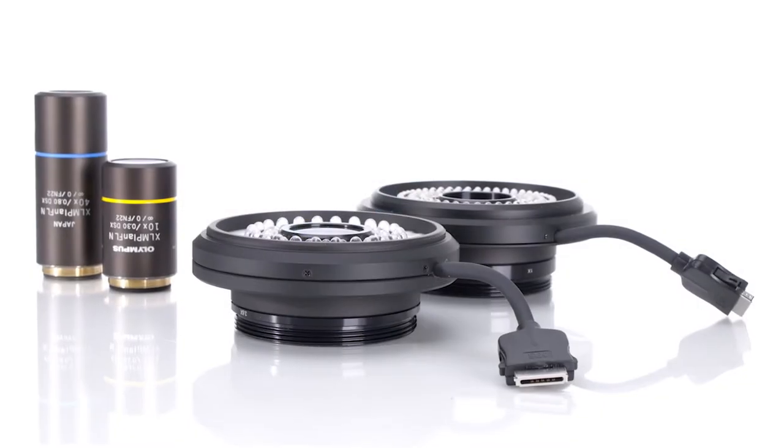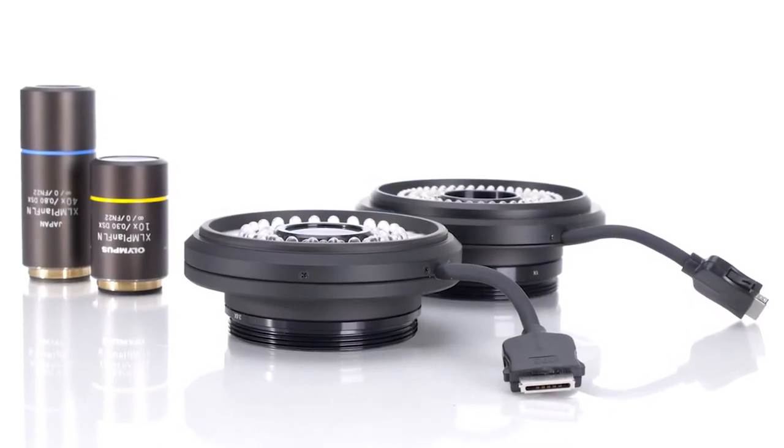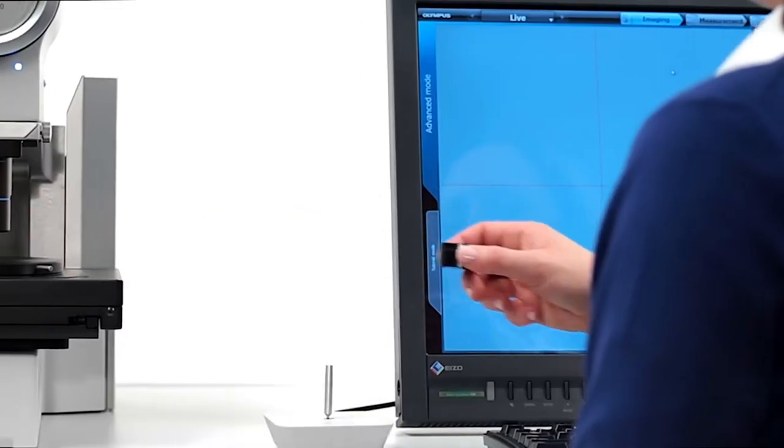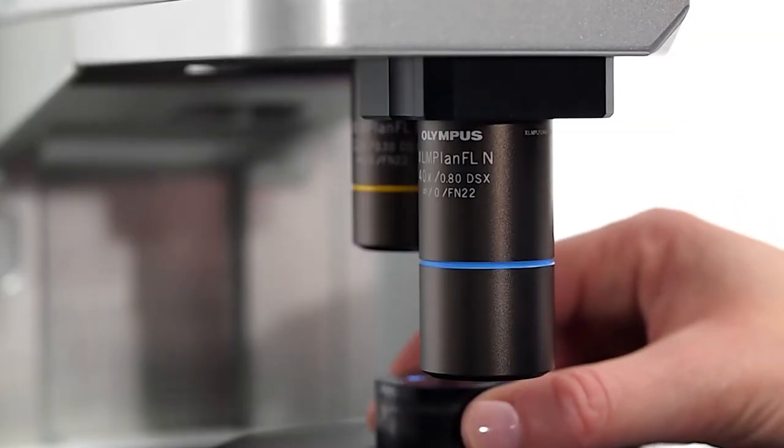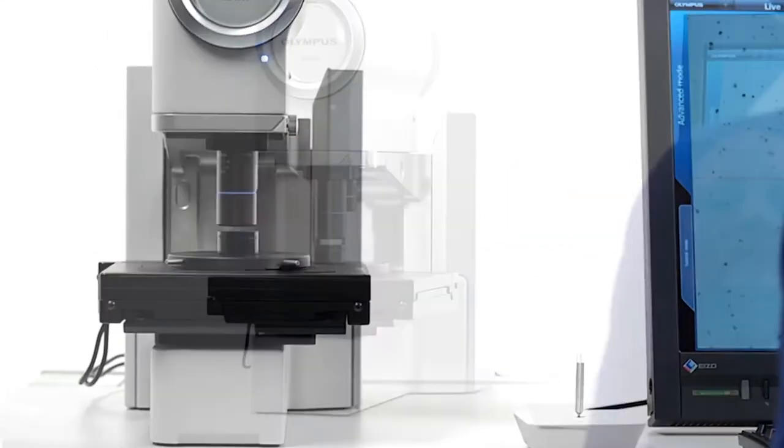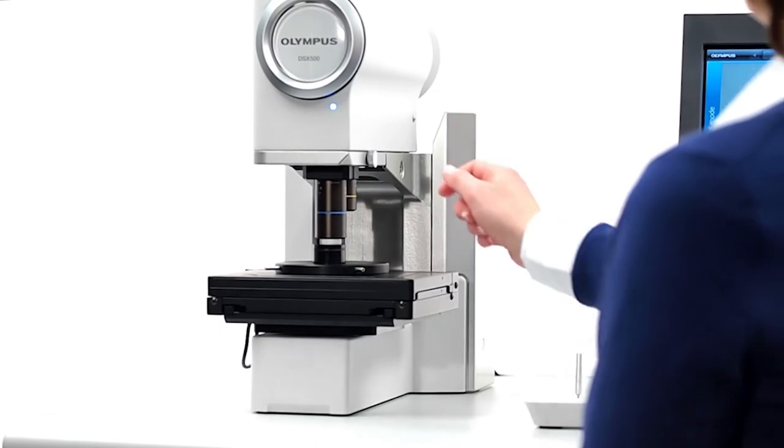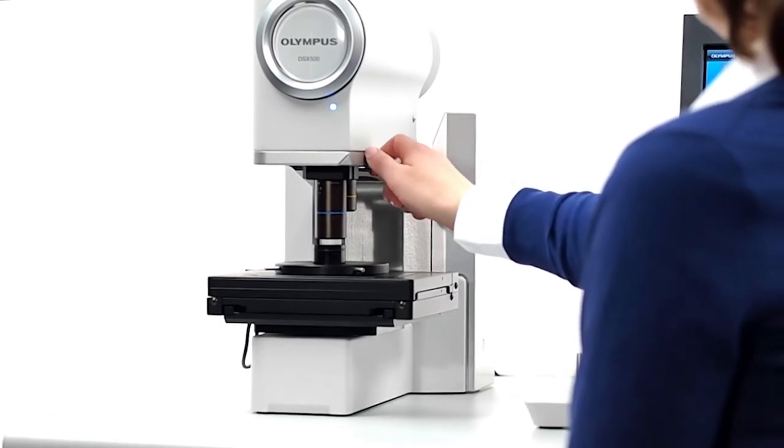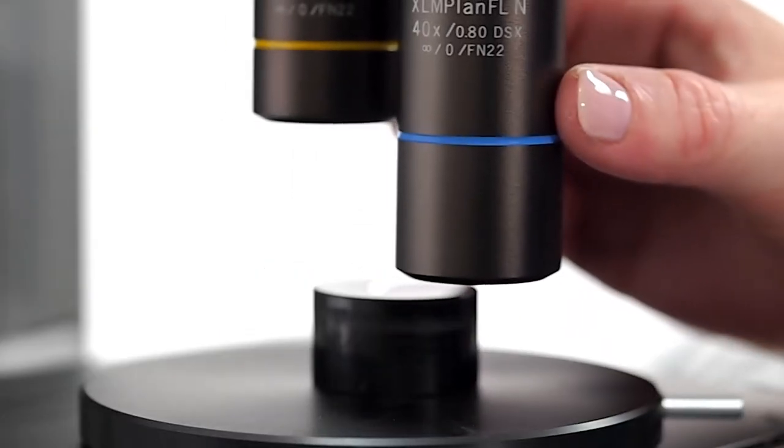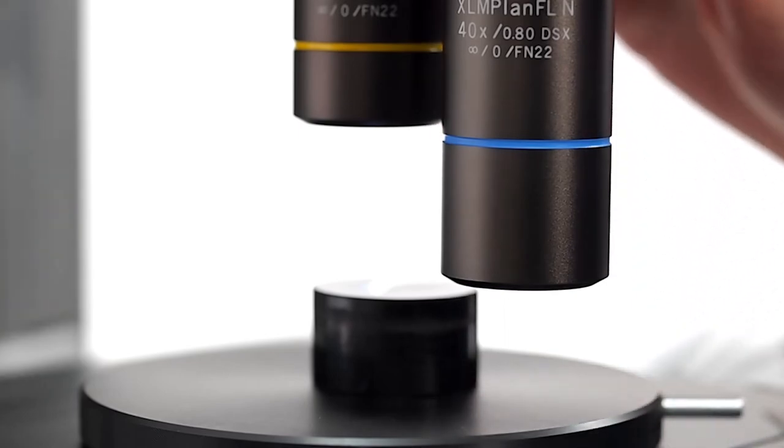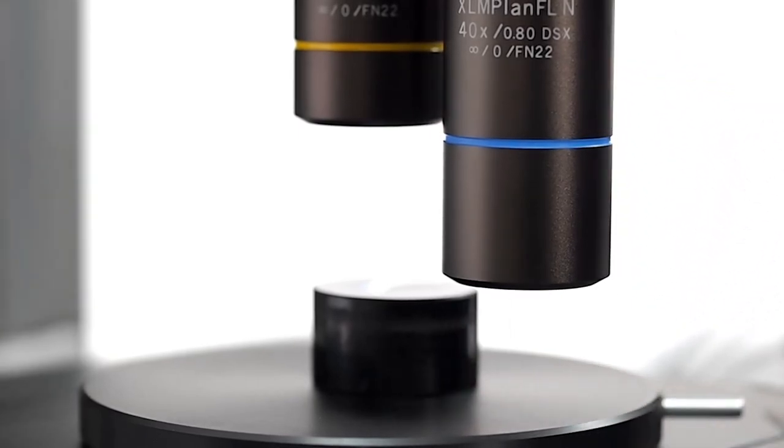New objective lenses specifically designed for DSX have high numerical apertures and long working distances for accurate observation and metrology in the widest range of applications. That provides you with extra room for uneven samples while preserving the high resolution you need.